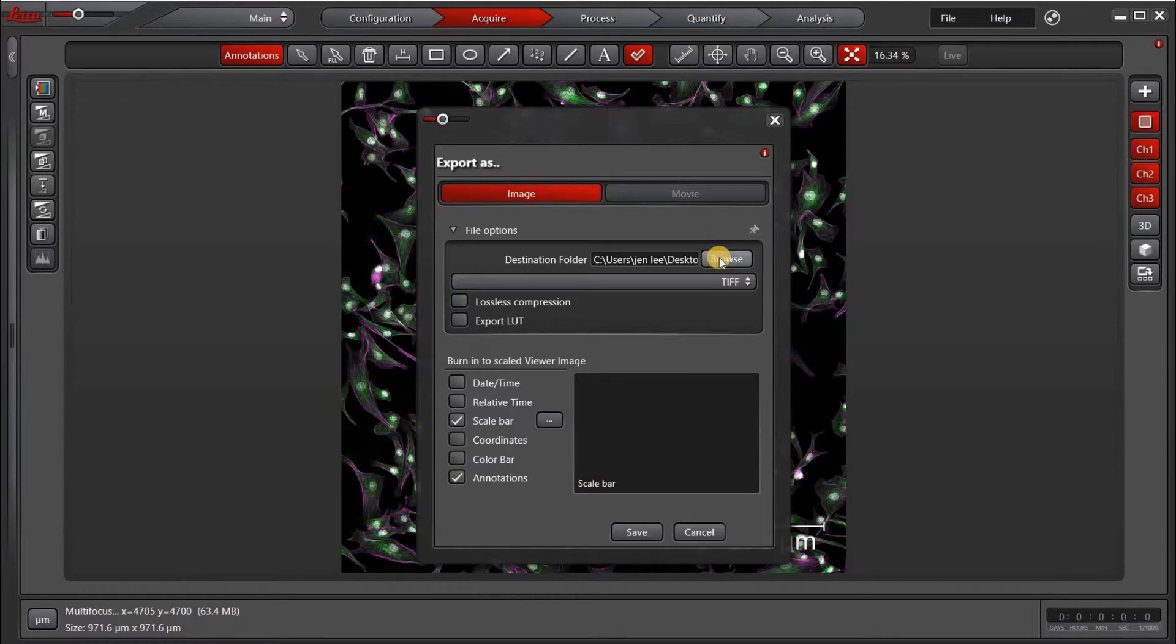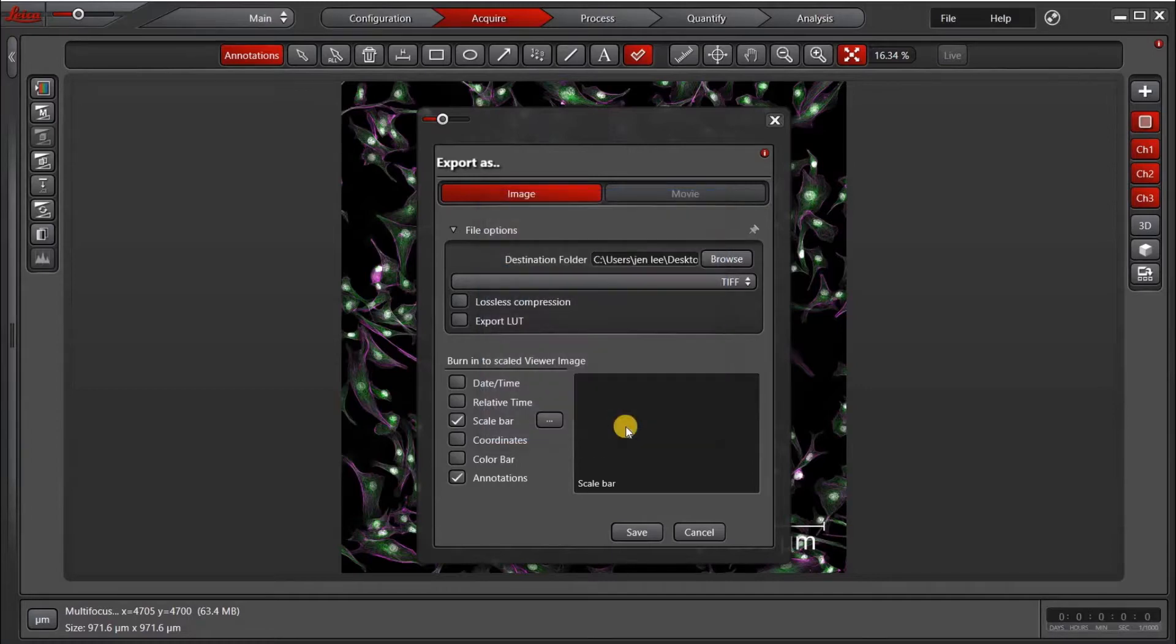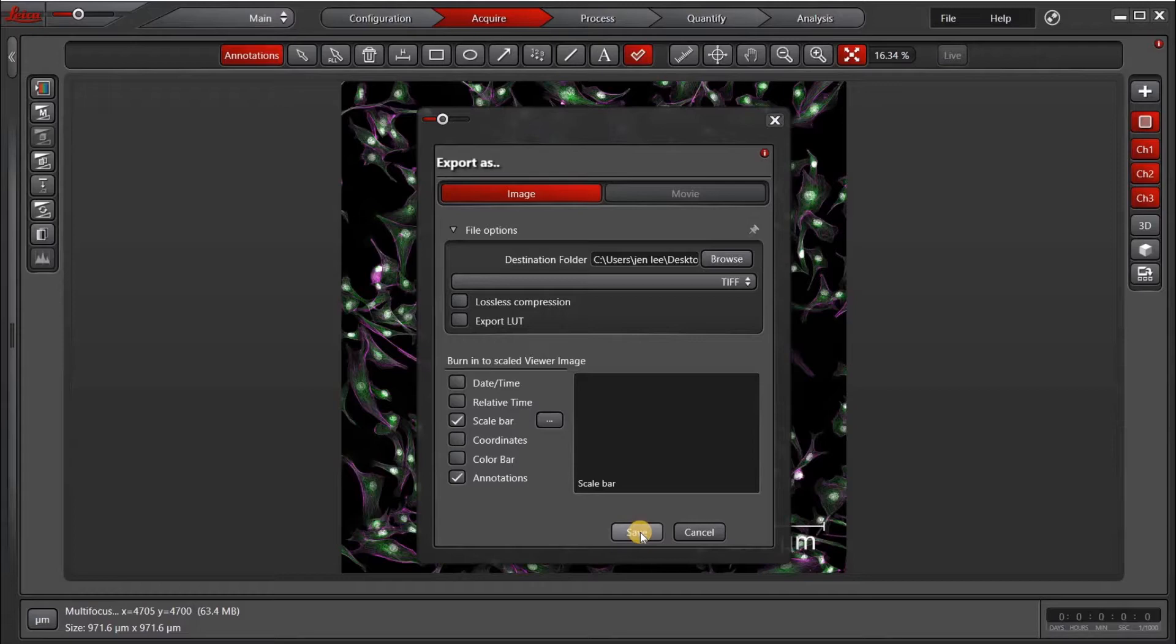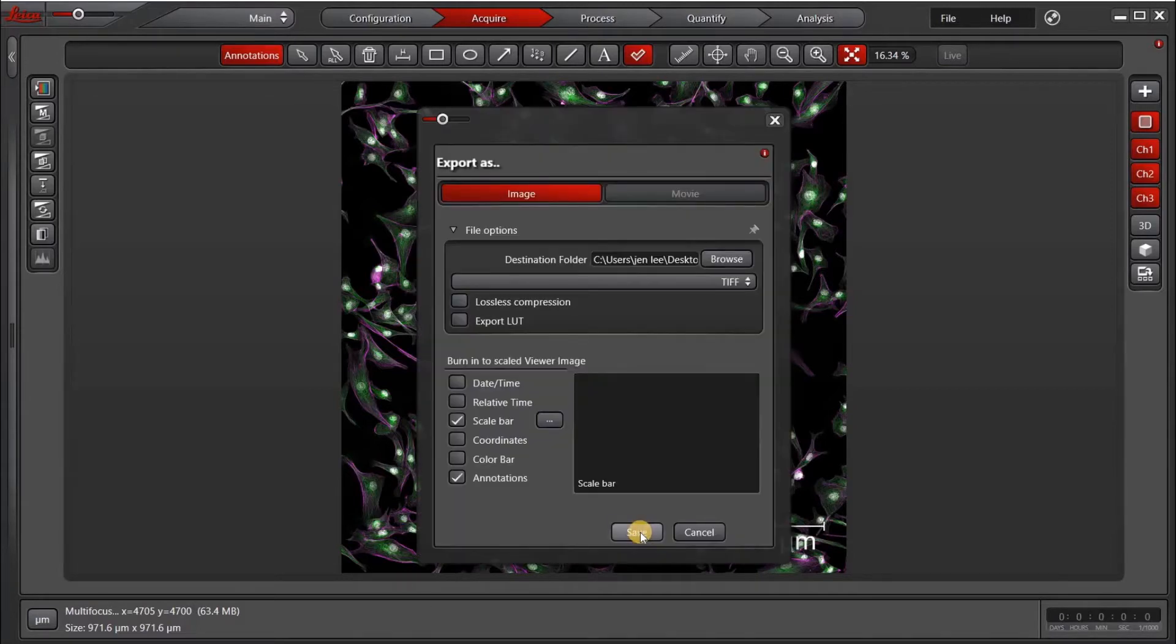I'm going to choose my destination, which is the desktop. Of course, you can save it anywhere. Don't forget to check the annotations bar if you want to export the scale bar that you drew earlier. And I'll go ahead and press Save.